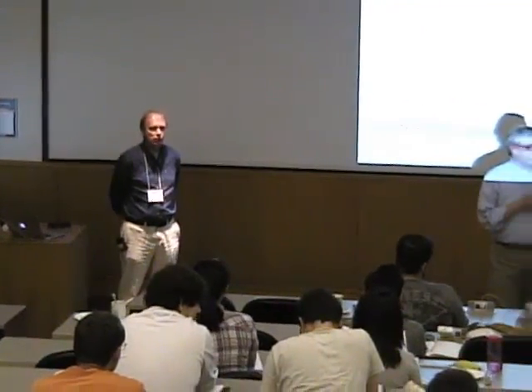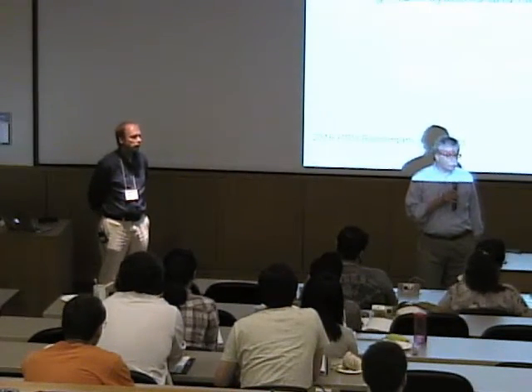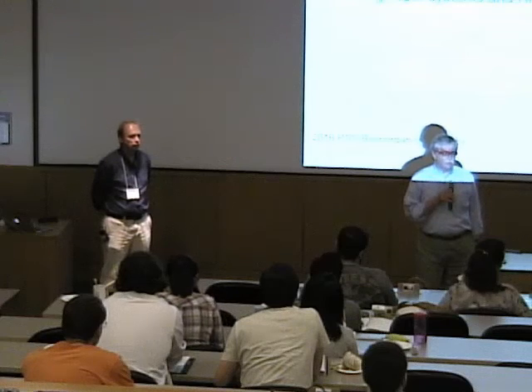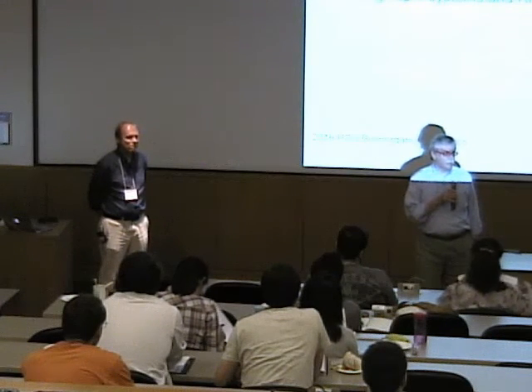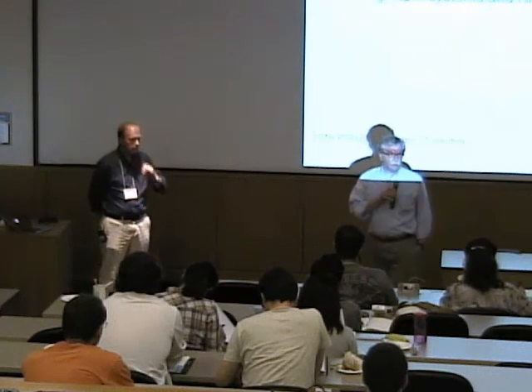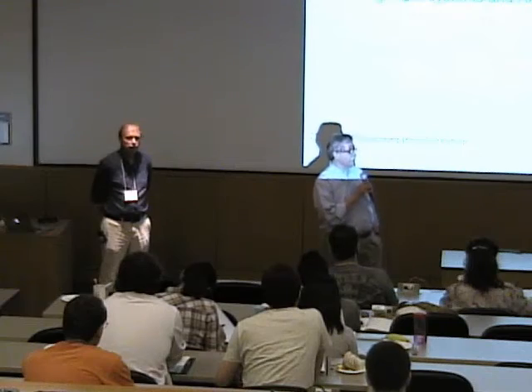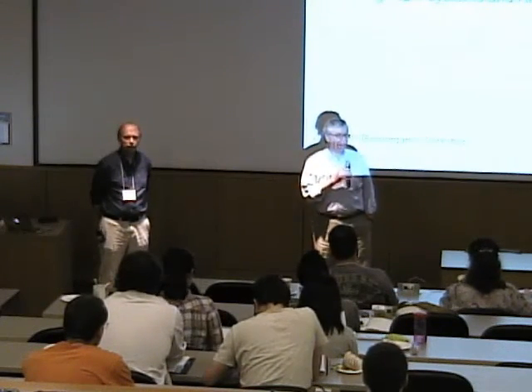Art and I coordinated this lecture with EPR1. So those of you who are taking EPR1, you'll be looking at a slow relaxing organic radical. You'll be looking at a fast relaxing iron sulfur cluster. You'll be doing temperature dependencies, power dependencies, amplitude modulation dependencies, and we'll finish up with a high-spin system. So if you're doing that, much of this will be reinforced in real time in the laboratory. Are there any questions for Art?